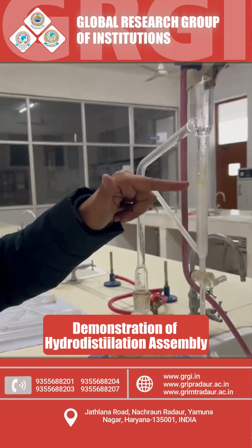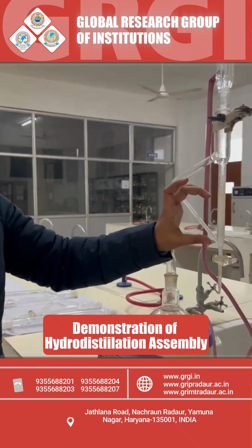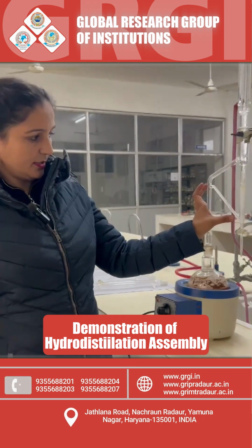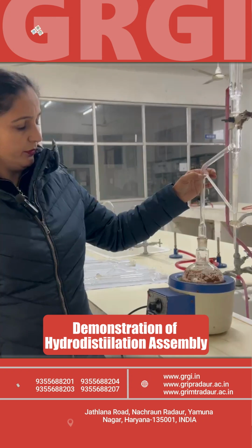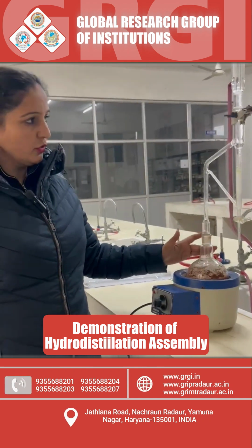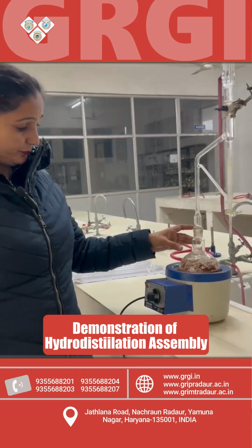You can see here the light yellow golden layer is of volatile oil and the layer of water will form at the bottom. As the level rises up to this height, the liquid flows back inside this RBF. In this way, the same water is continuously used throughout this process.